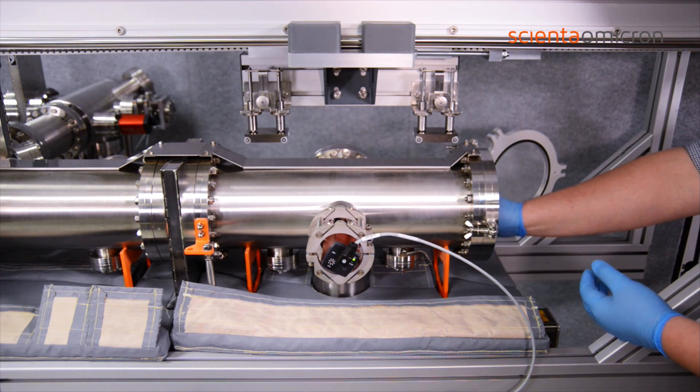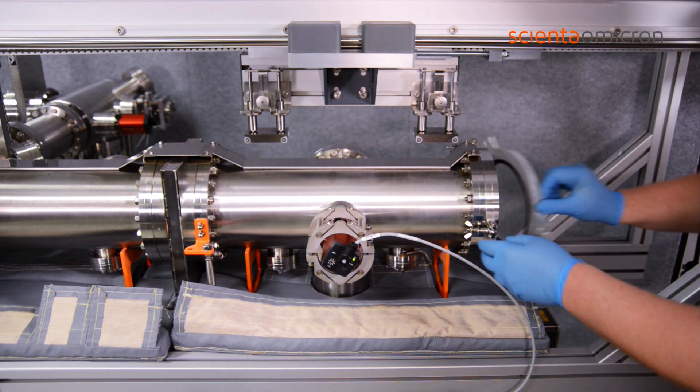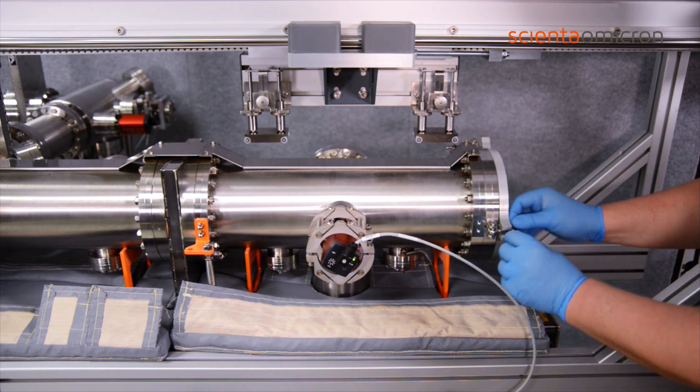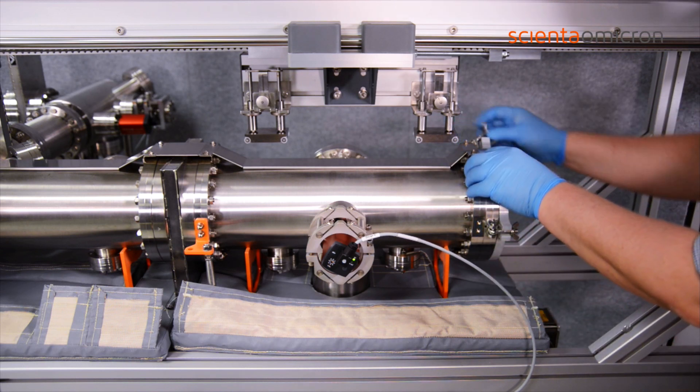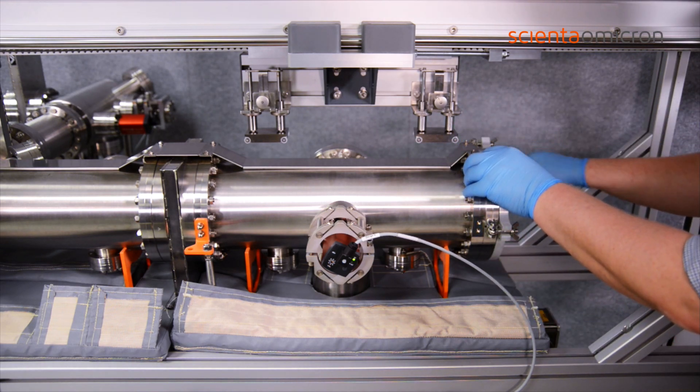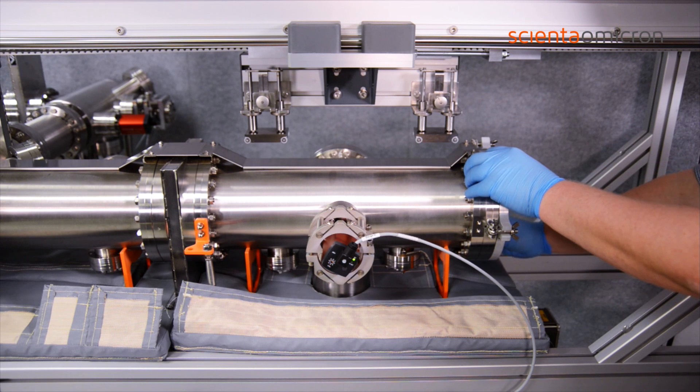Composed of independent, movable, 3 meter long segments, the linear transfer line efficiently connects new and existing growth and analysis modules, maximizing lab space for material innovation platforms.